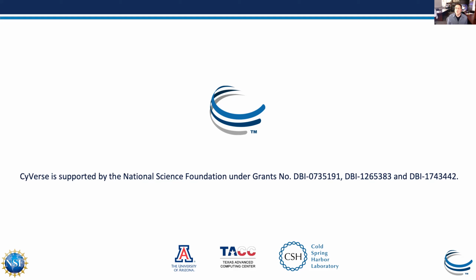So I'll be updating some of my own information, and at that time maybe I'll find a way to connect the synteny to Circos a little better and update this information. If the person has a direct question, they can contact me, and I can help guide them a little better. But it's for visualizing the synteny, not extracting it.